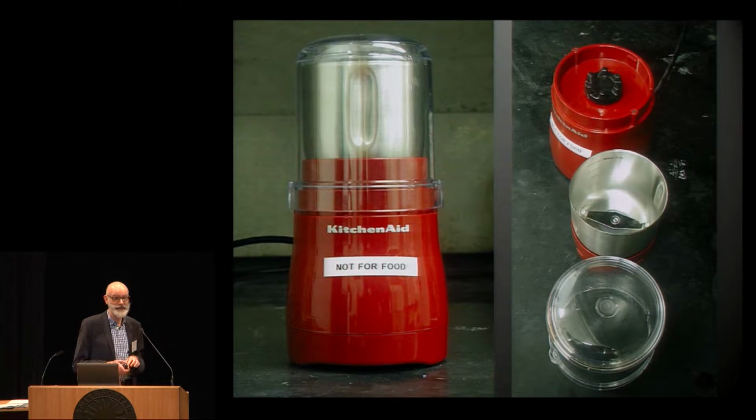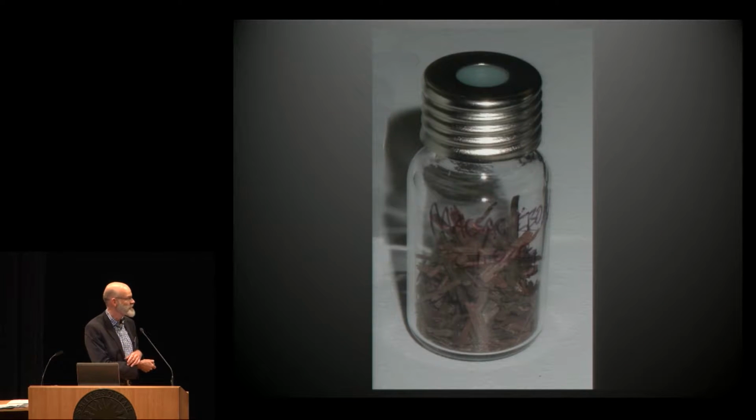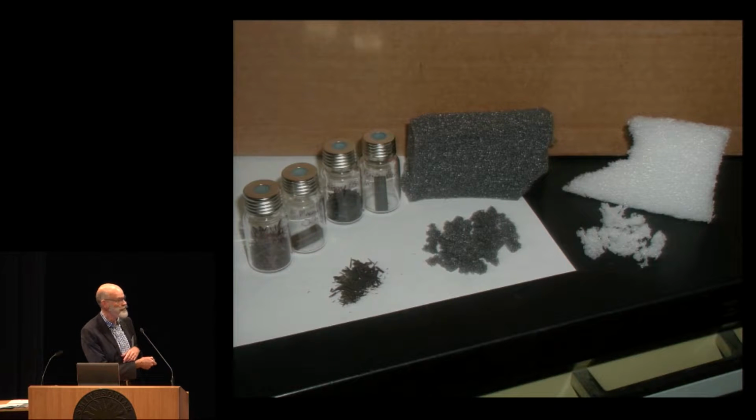This is also a very useful tool for sample prep. I had been looking for these very expensive maceration things and came across this $40 KitchenAid thing. It's stainless steel, it cleans out really easily, and it's really powerful. This was a really hard piece of ebony, and it took care of it in about 30 seconds, so it's excellent. It also works on all kinds of other materials, like foams of various kinds. And here are some of the sample vials with sample bits in them, so you get an idea of the size.